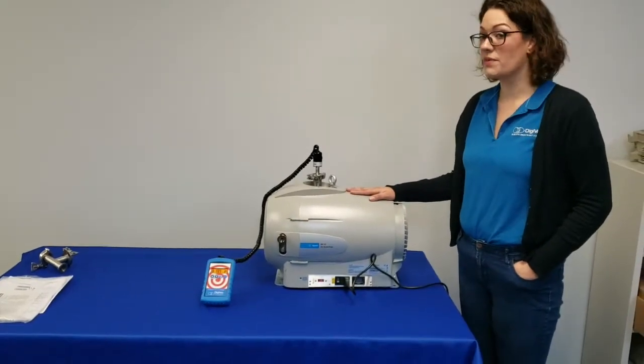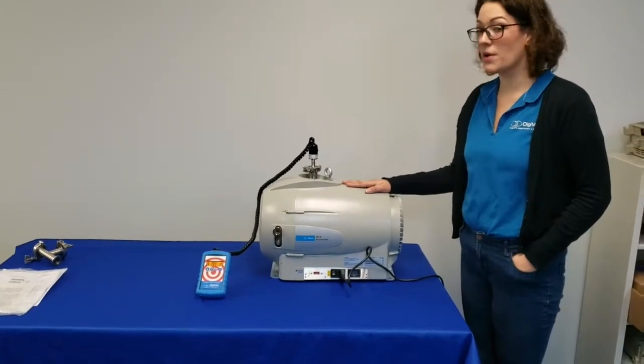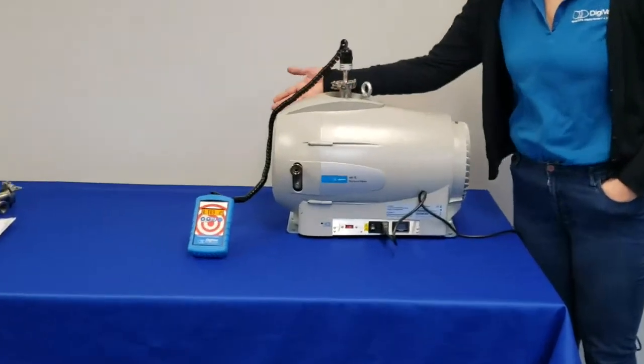You'll notice how quiet this pump is, with very little vibration, reading only approximately 60 decibels. Most of which comes from the fan.